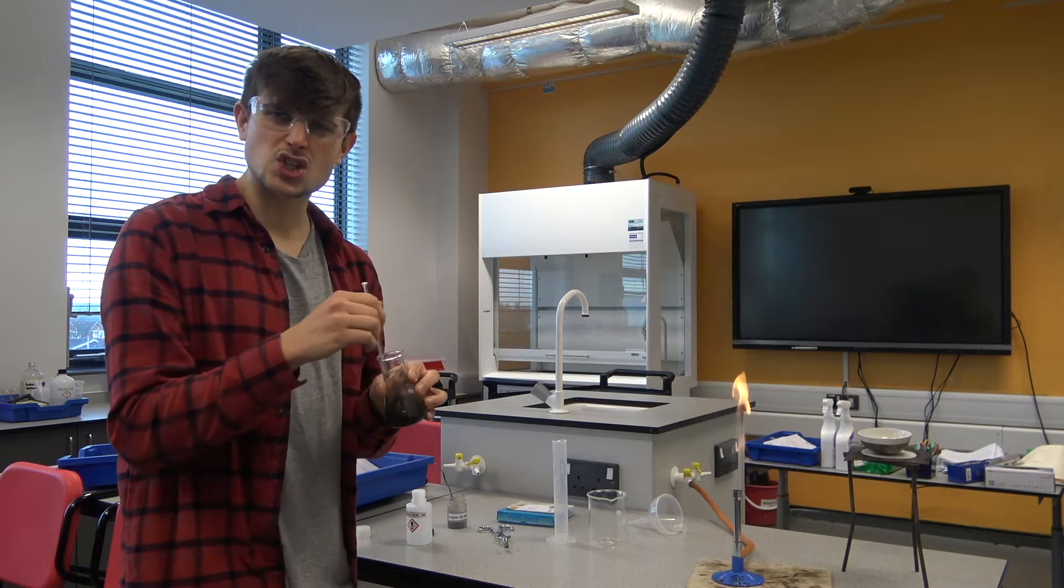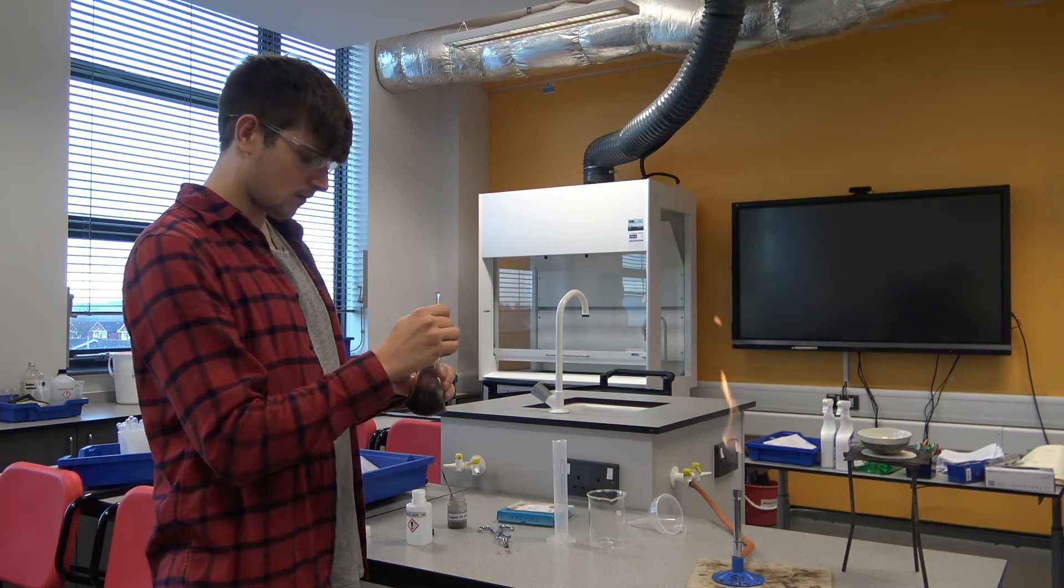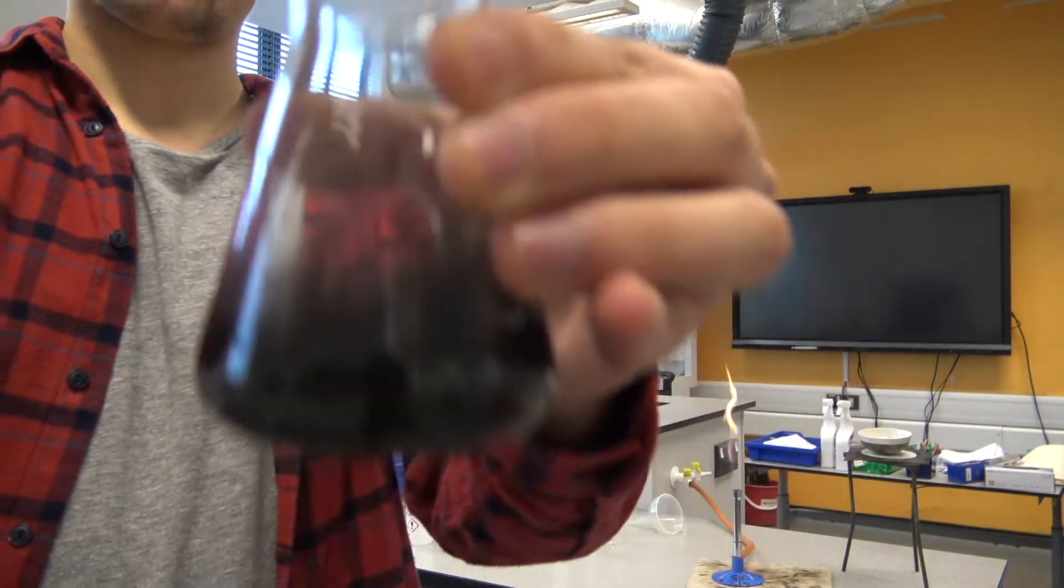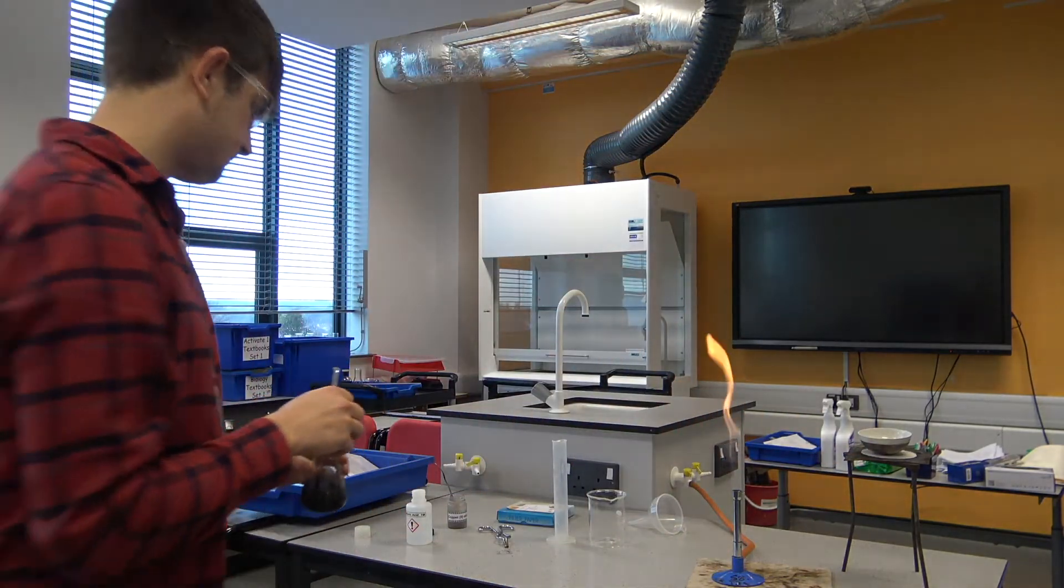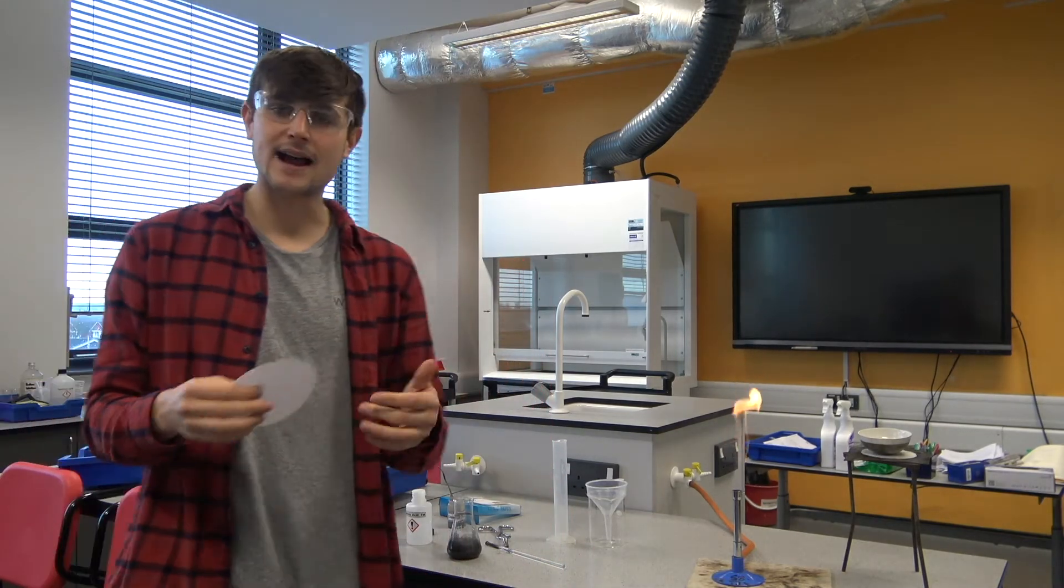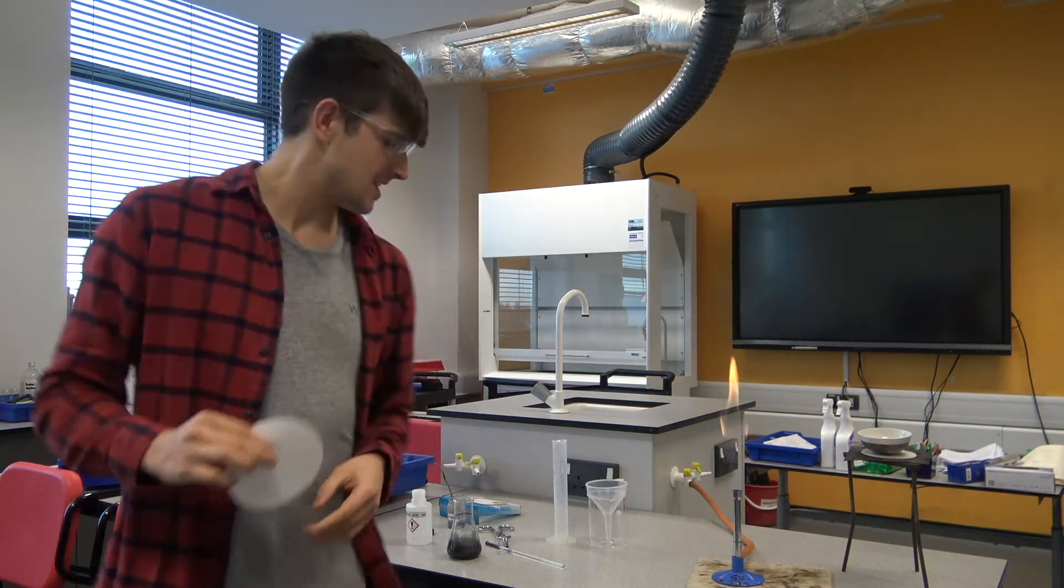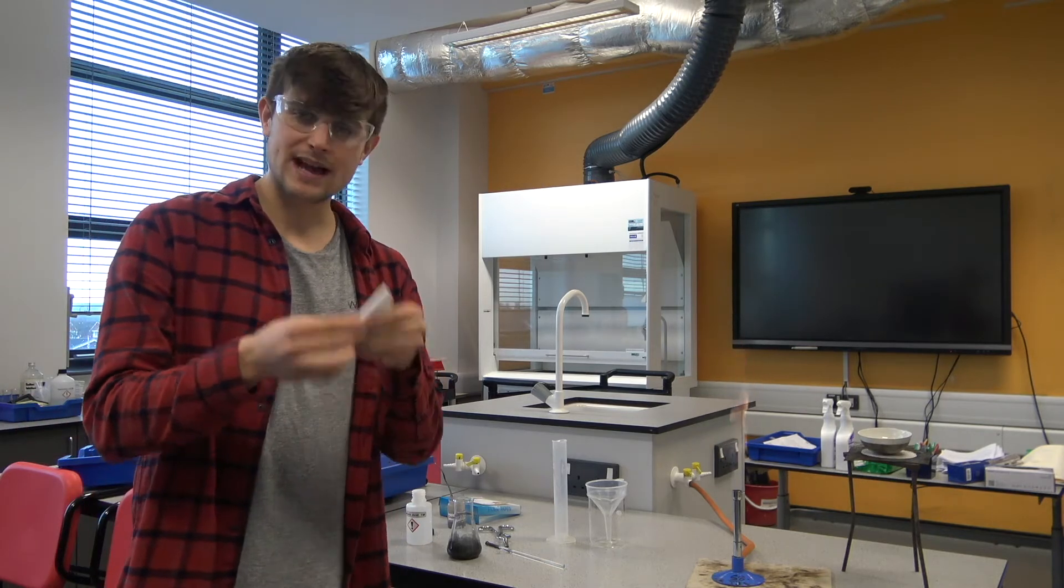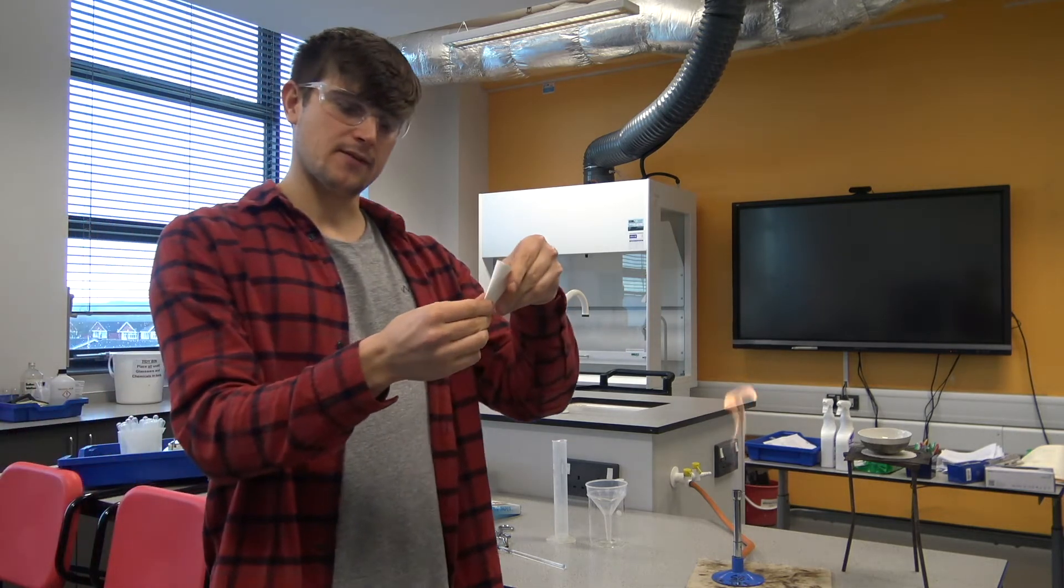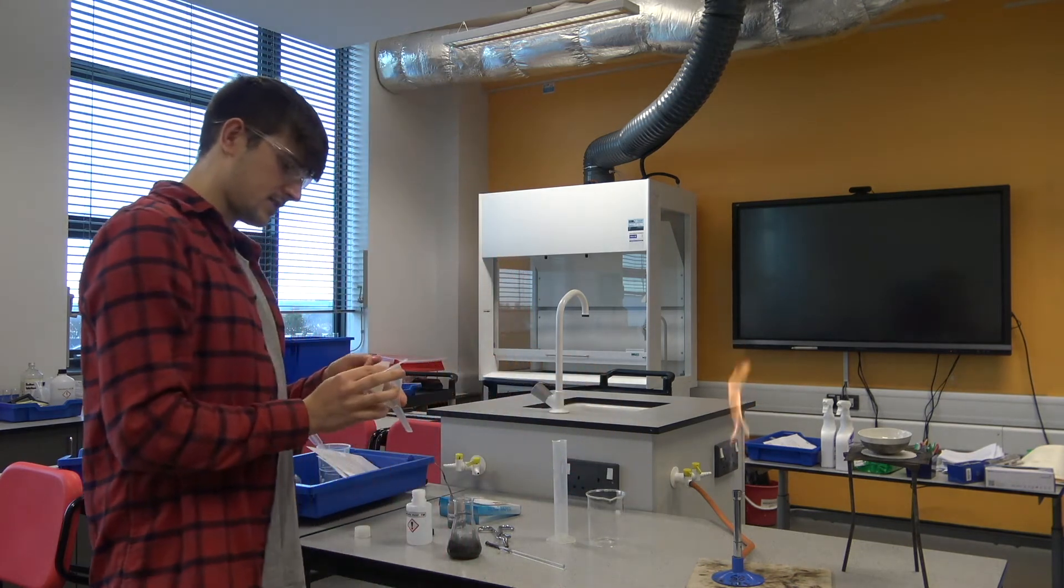The next part of the reaction is filtering that copper oxide which is unreacted inside. We said we added it in excess, so we need to get rid of that solid. The way we're going to do that is by using filter paper. The key to making filter paper is by folding it in half and folding it in half again, and you put that inside your filter funnel just like this.